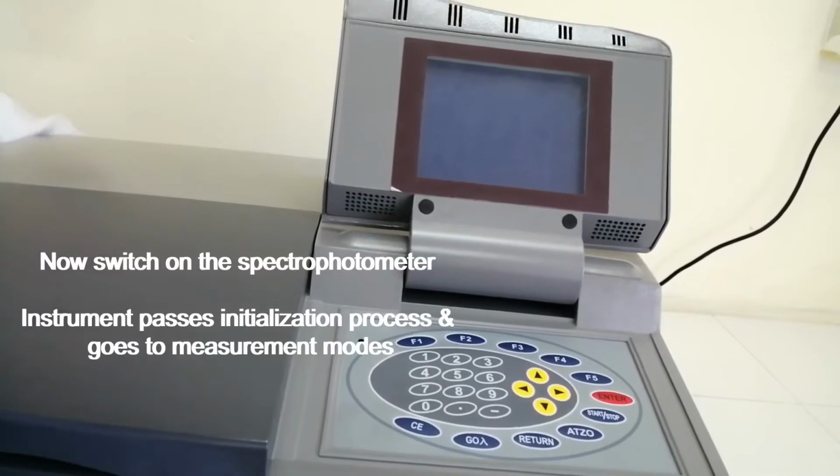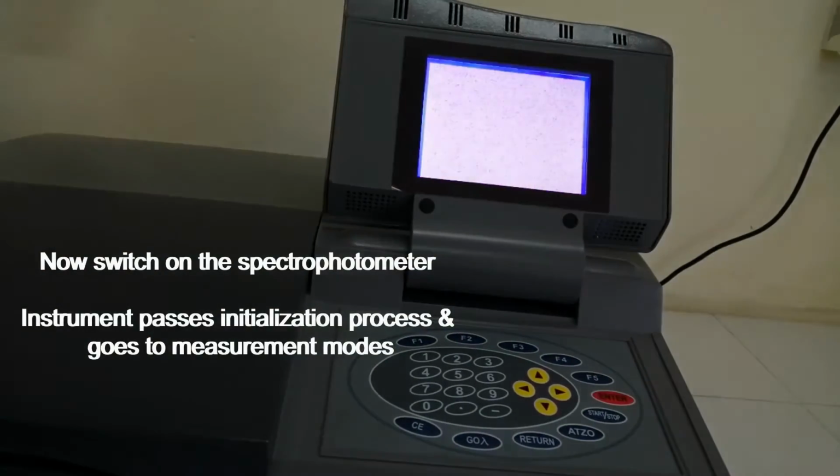Now switch on the spectrophotometer. The instrument passes the initialization process and goes to measurement modes.